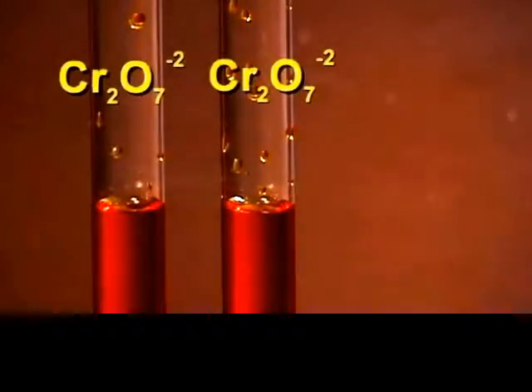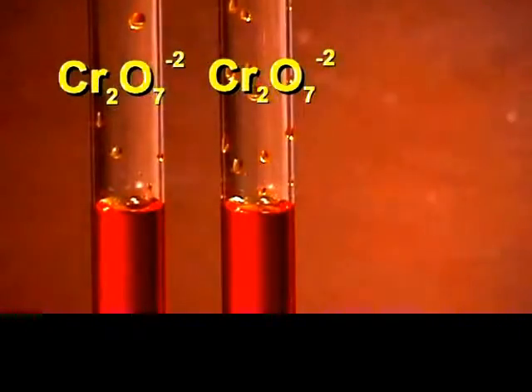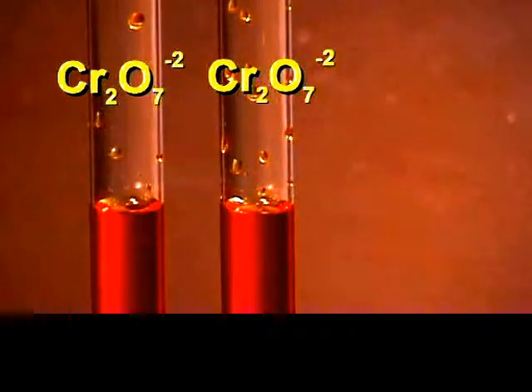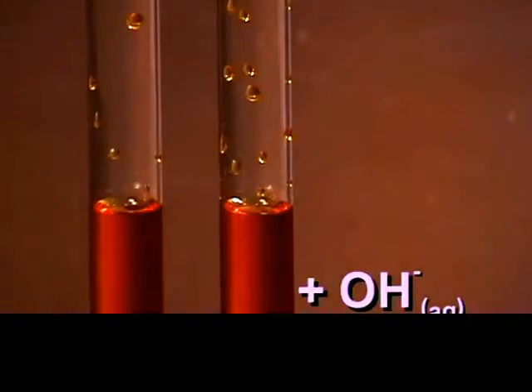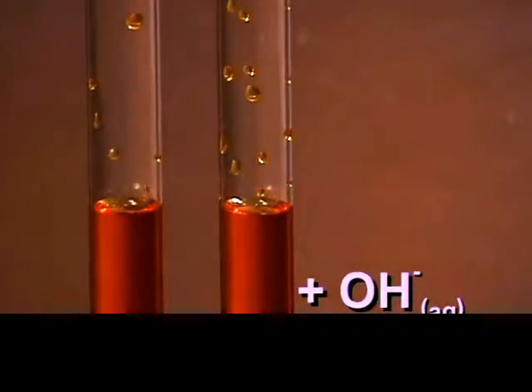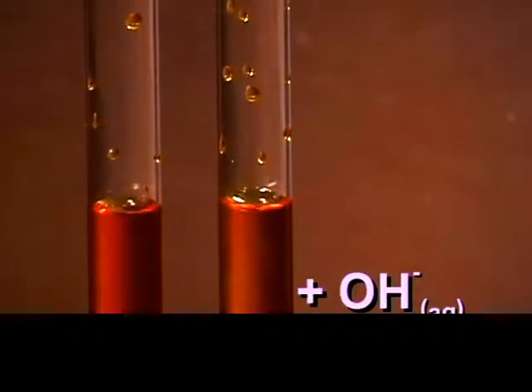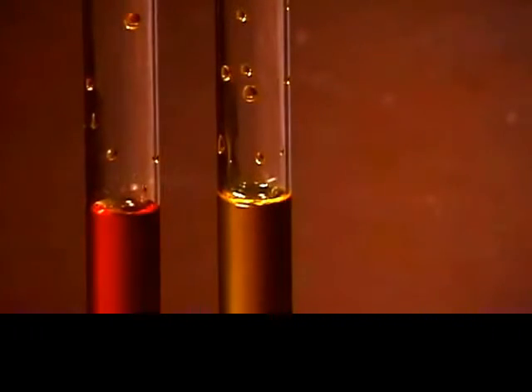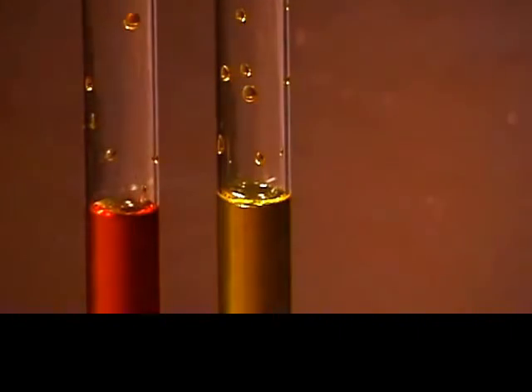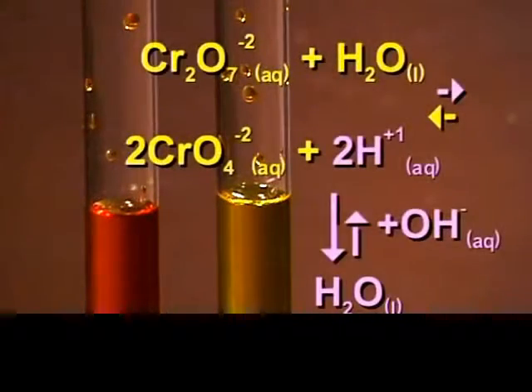We have two test tubes containing a solution of potassium dichromate. We will add some 6 molar sodium hydroxide to one of the tubes. We notice that the solution turns yellow, which indicates that the equilibrium has shifted from the dichromate to the chromate.